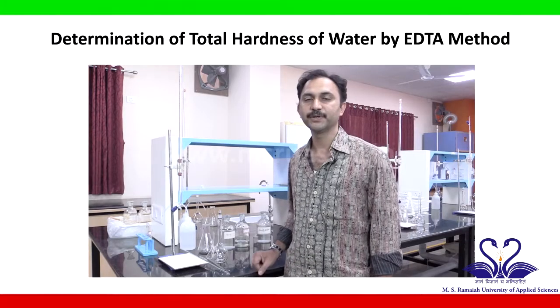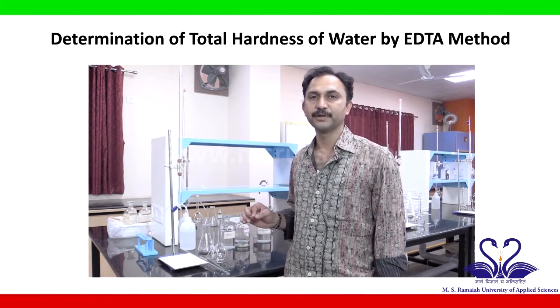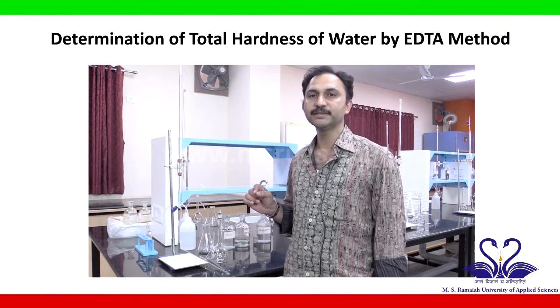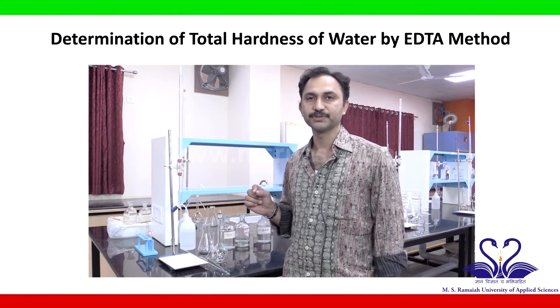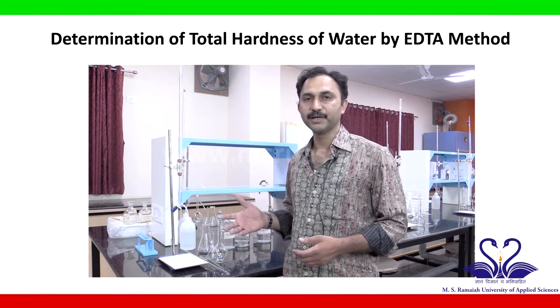Hi students, today we will be learning one volumetry experiment. The aim of the experiment is to determine the hardness of the given water sample. So hardness is a property of water which does not give lather with soap solution. Hardness can be divided into temporary hardness and permanent hardness.